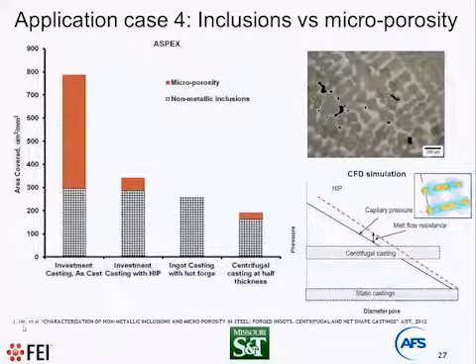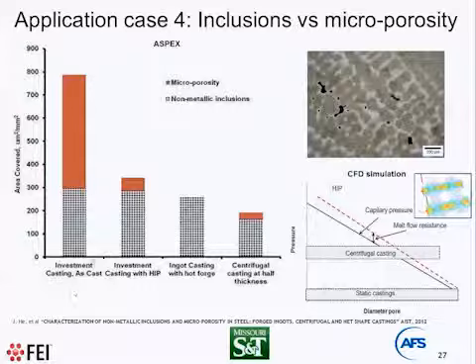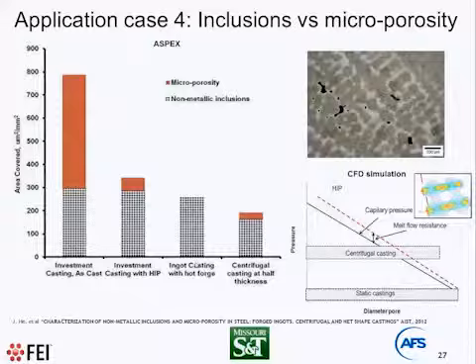This study was done by our grad student. His name was He. He studied castings from the same Eglin steel received from different foundries, produced by different processes. It was investment casting steel. It was ingot from forge, because in this case we talk about competition between cast and forged products. It was centrifugal casting. And we also apply the so-called HIP process, hot isostatic pressing. So he developed a special technique that allows us to identify and separate microporosity from non-metallic inclusions.